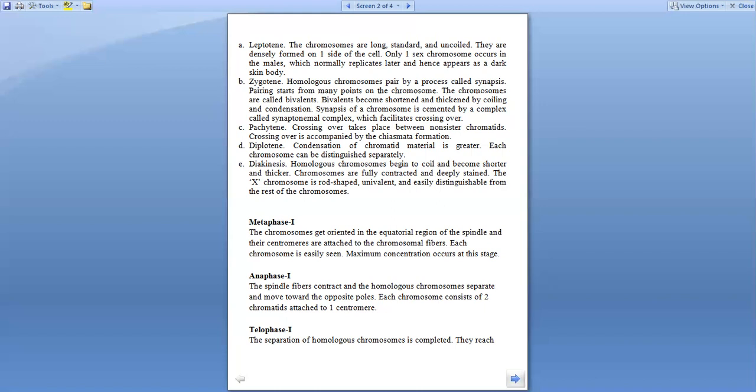After this we have metaphase I, where the chromosomes get oriented in the equatorial region of the spindle fiber and the centromeres attach to the chromosomal fiber. The chromosomes are easily seen and at maximum condensation.